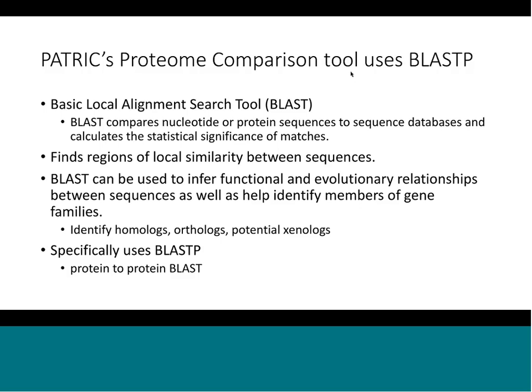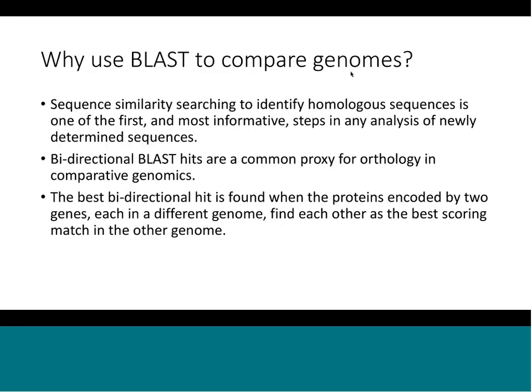The proteome comparison tool in PATRIC uses BLAST-P, which is a protein-to-protein BLAST. I'm going to keep making this point because often we get people who are trying to submit nucleotide sequences. The tool works with the proteins and not with the nucleotides.